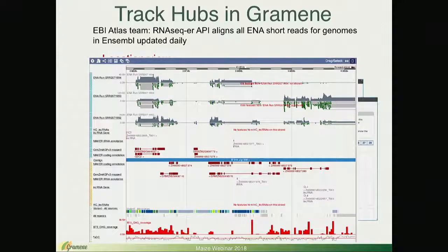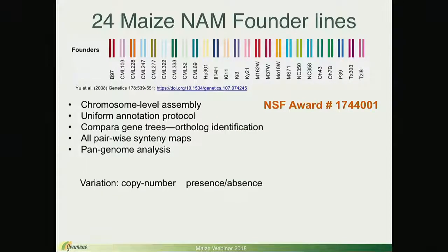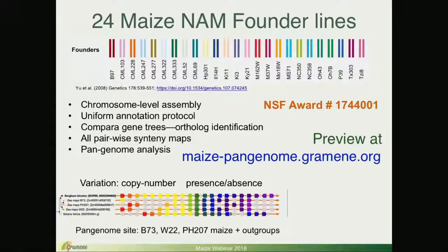Now I want to switch quickly in the last few minutes to bring up the Maize Pan-genome project.